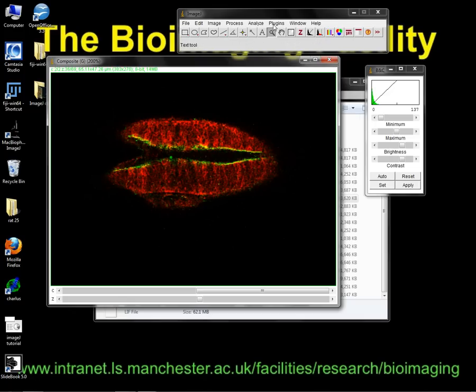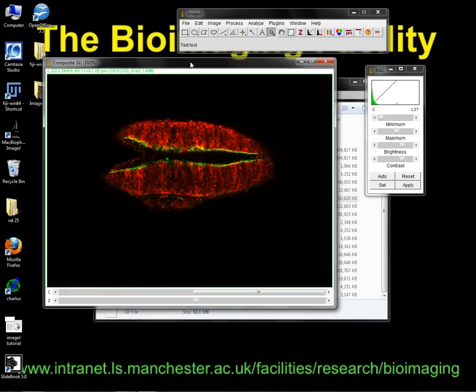Ah, you mean the options that you have, where you have the big window of how to open it and things like that. If you don't say open entire stack, maybe it'll just open the first Z or something like that. So this is one of the things where you have to spend part of that week doing nothing apart from playing with ImageJ, just deciding how you want it to open. Do you want them to open up as an RGB merge stack, or as red and green separately? Do you want them as pseudo-colored? Would you rather it be black and white? It goes on and on and on.